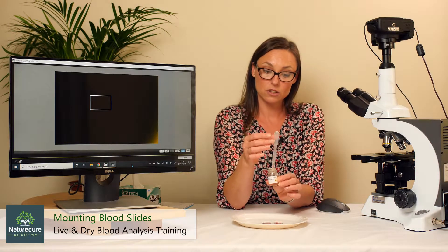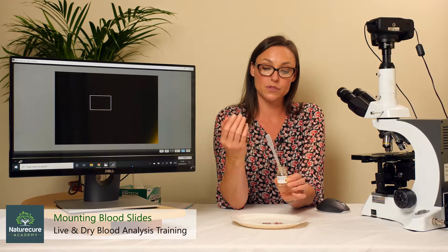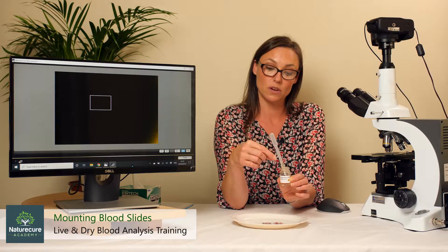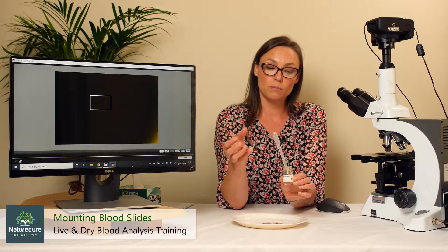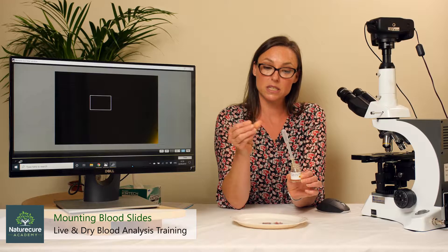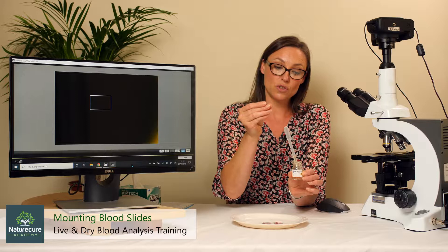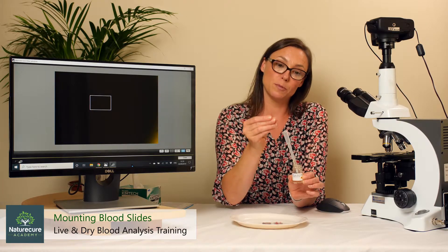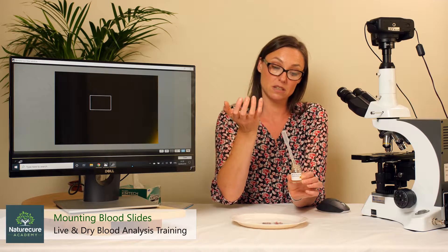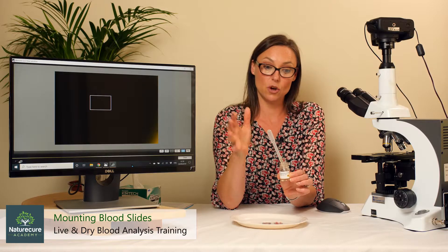You use a pipette usually to be able to apply the oil. One of the most important things is to not allow any air bubbles to get into the oil. So when you first open up your oil and you immerse your pipette into it, it's important that you squeeze the pipette slightly so that as soon as the tip enters the oil and you let go, it will suck oil up into it and no air. And that's what my pipette has — no air in it, just oil.